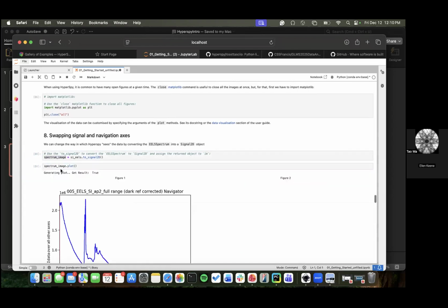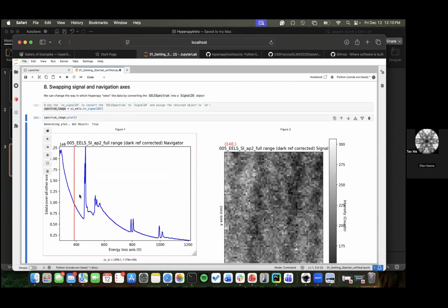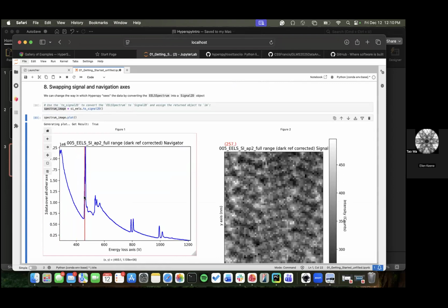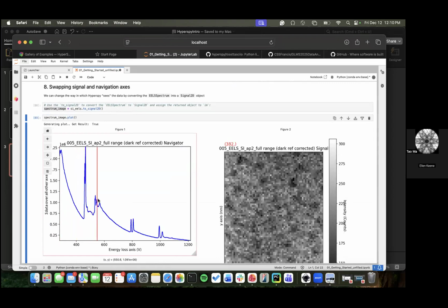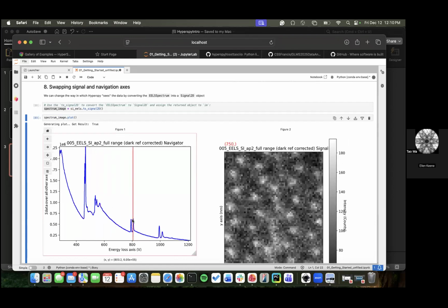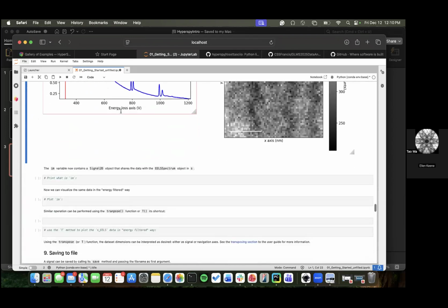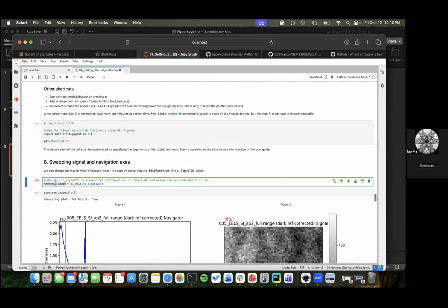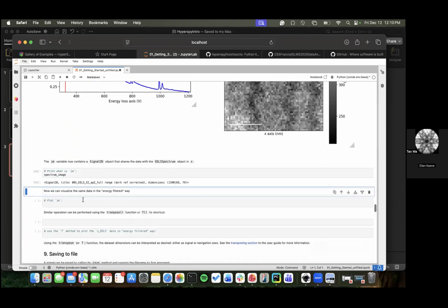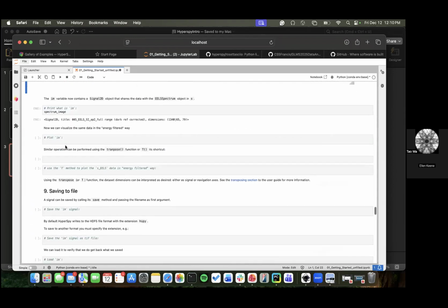If we plot that, you can see now, if I use shift, as we go across we can look at each of these individual peaks, and you can see the different structure in there. So you start to see some of the atoms within this data set. It's basically the transpose. That's what this plot function is showing, the energy spectrum.